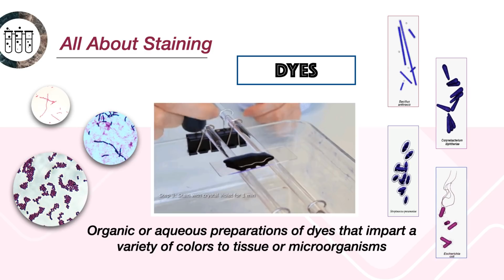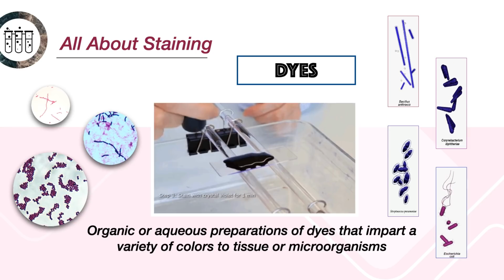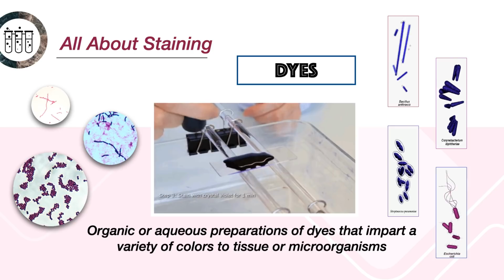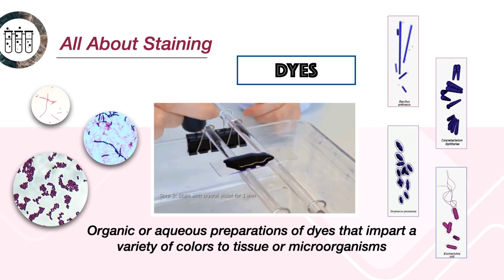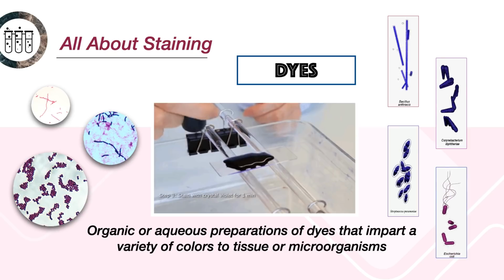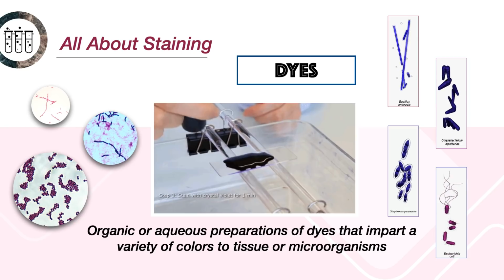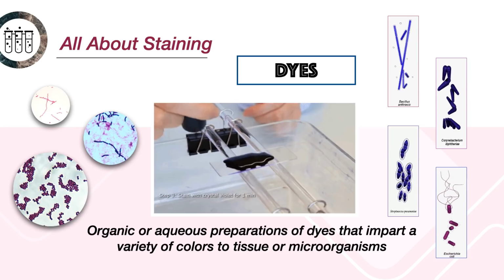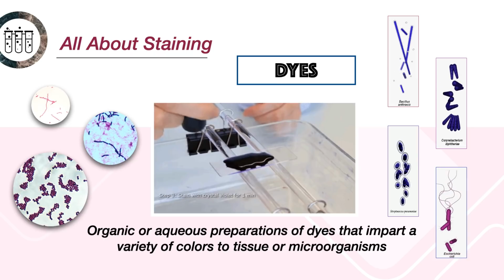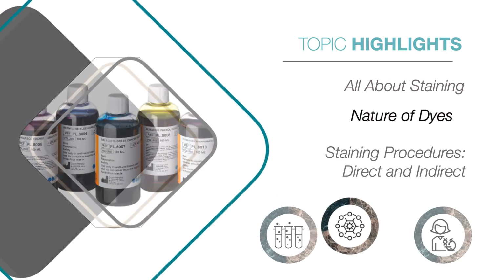So depende kung ano yung goal mo. Okay? Kung ano yung gusto mong mangyari, gusto mong makita, doon tayo magbabase sa kung anong stain ang gagamitin. Okay. Now, your stains, apart from the fact that there's a lot of them, they vary not only in color, they vary not only in purpose, but most importantly then, they vary in composition. Okay, that brings us to the nature of dyes.